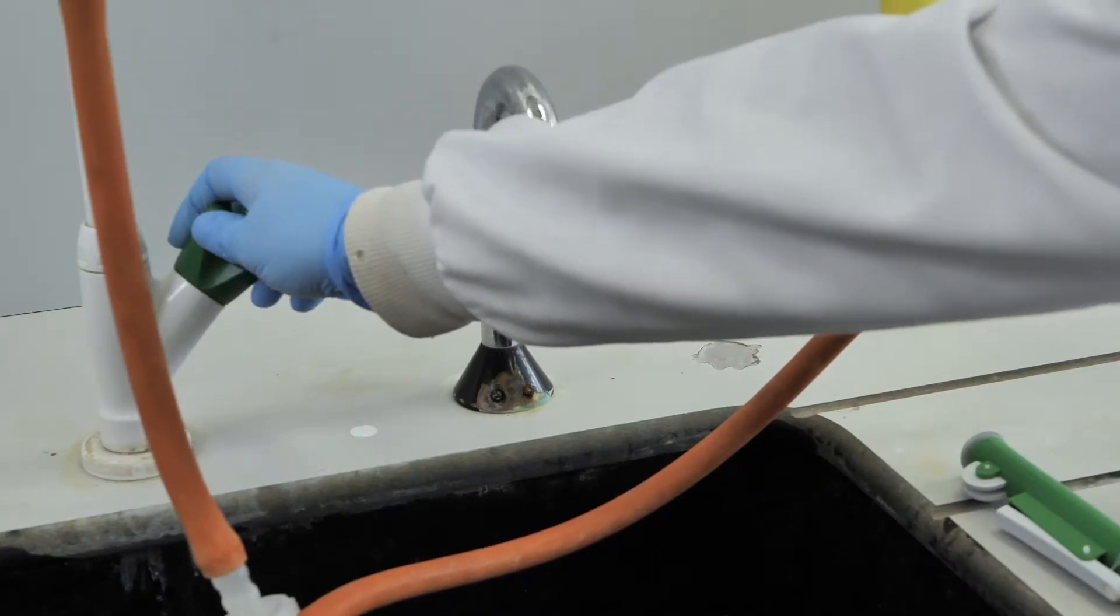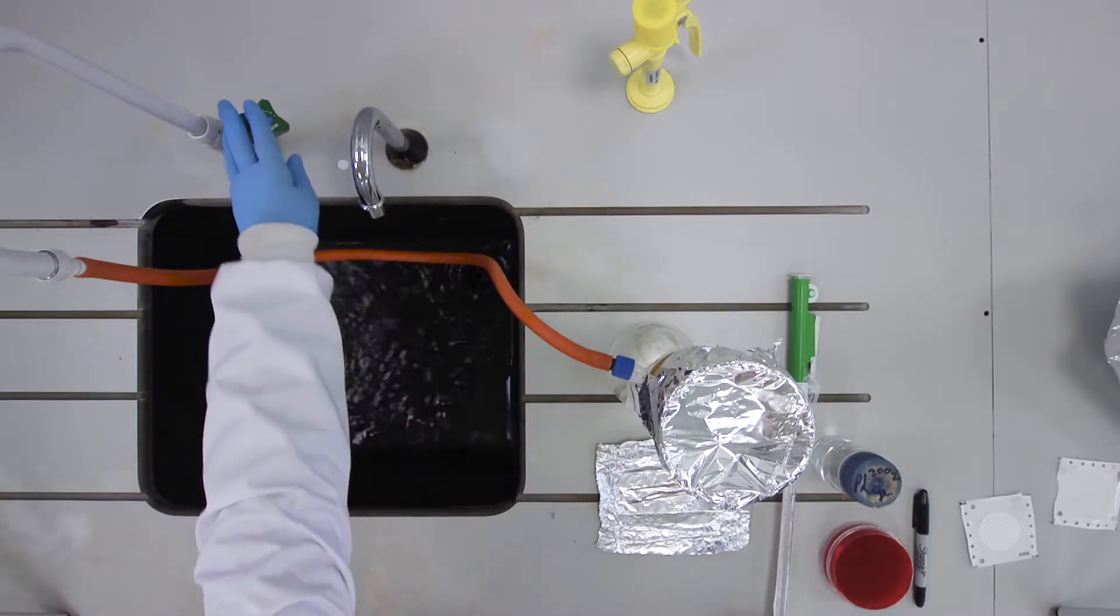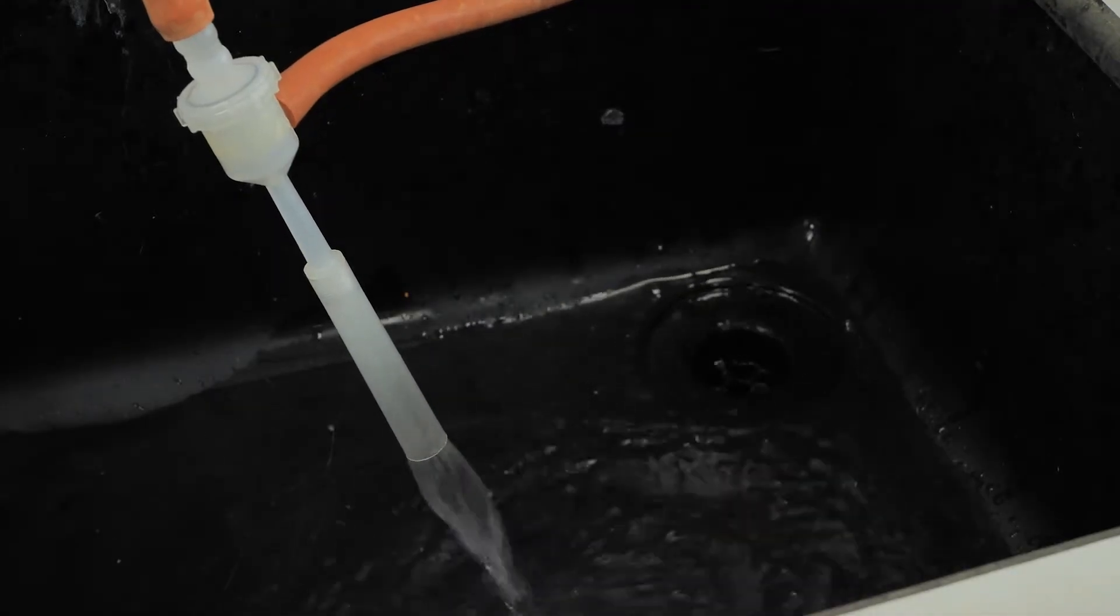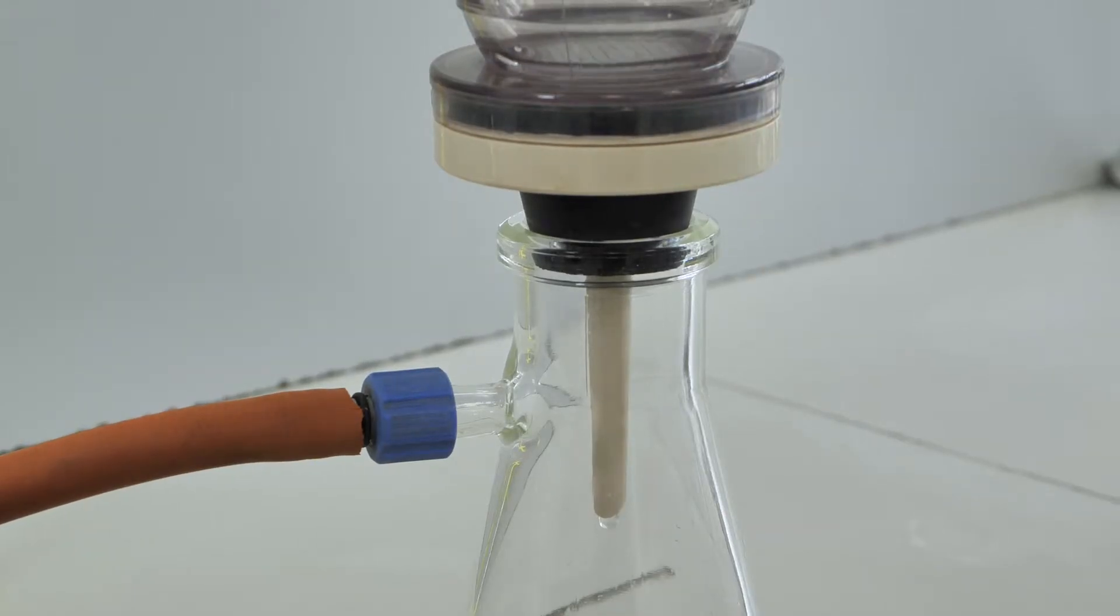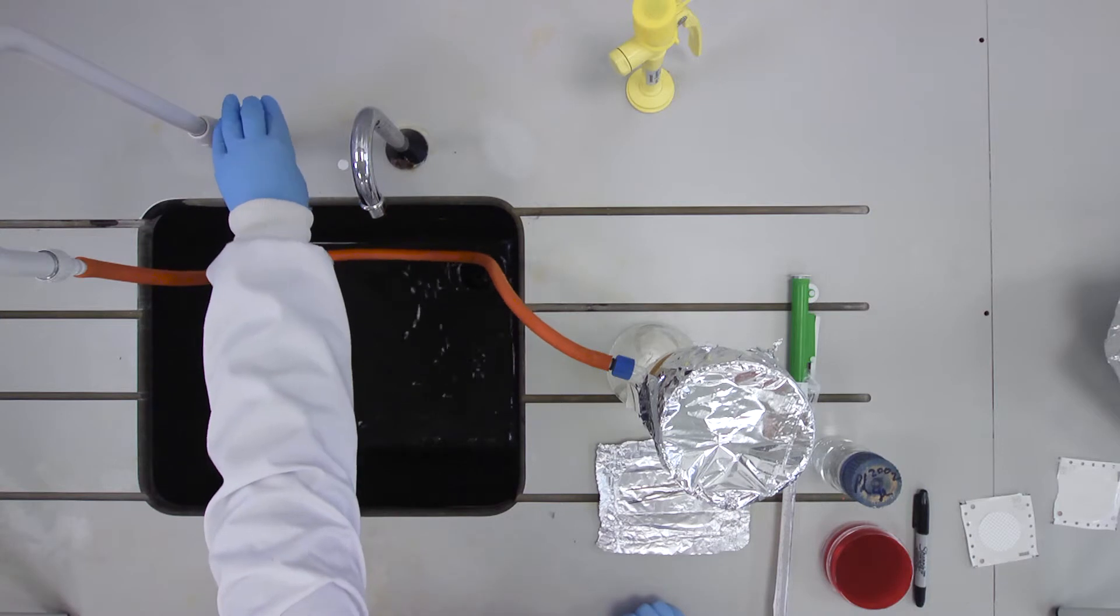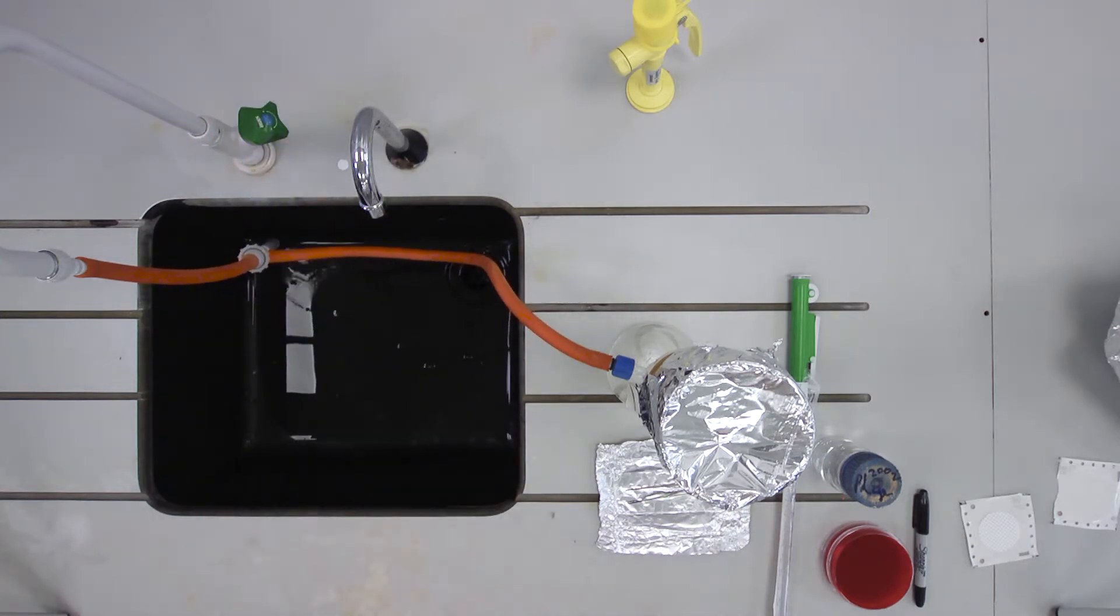Turn on the tap attached to the Venturi pump. You should see the liquid passing through the membrane and into the flask below. Once all of the liquid has passed through the filter, turn off the tap.